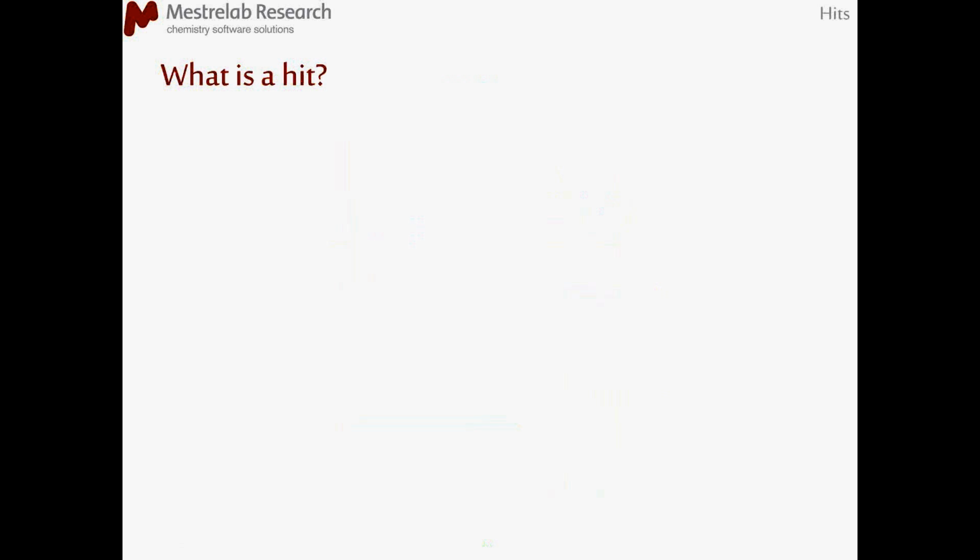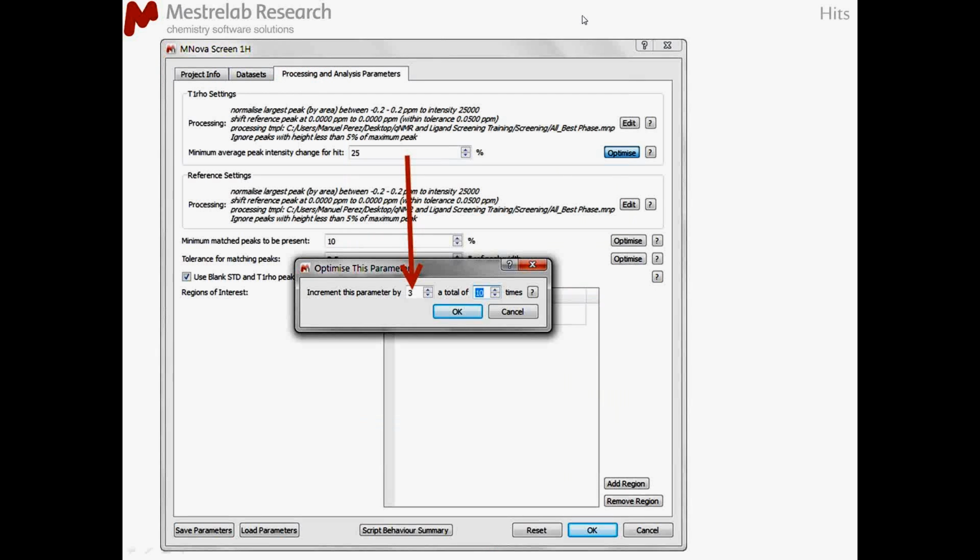The compromise that we came to is that we are going to allow you to define by yourself when you would consider that a hit is a hit. And that is by far the best approach from our point of view. You can change it, and you can also iterate over these signals. We will see more in a little bit about the particularities of analysis and processing parameters.